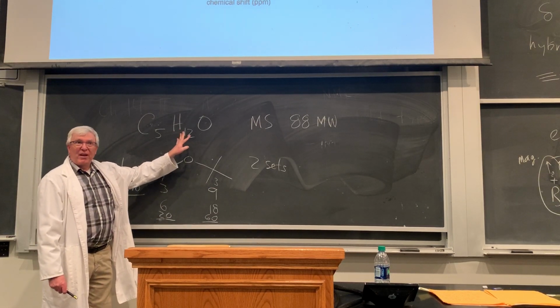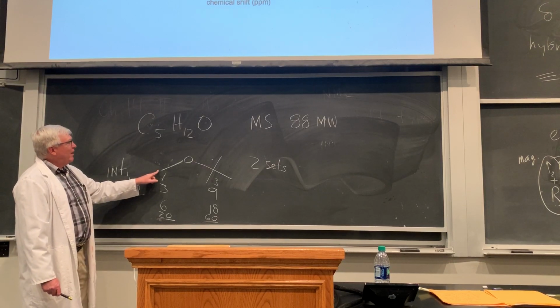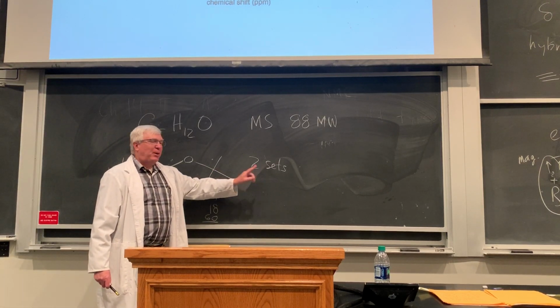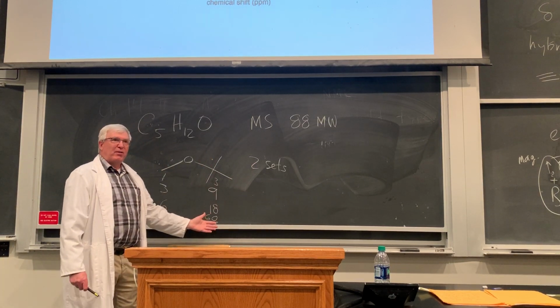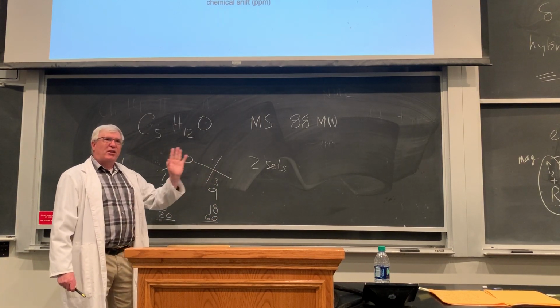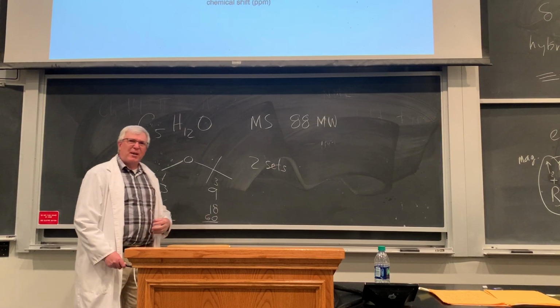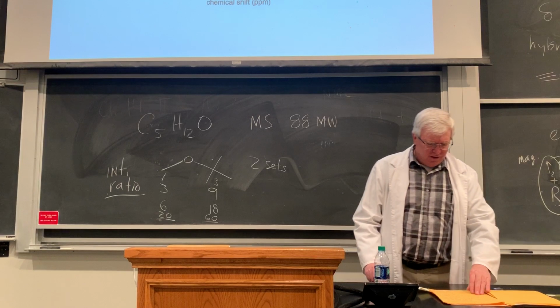So we're always thinking about what the formula might be before we apply that. A lot of times we can identify a set in an NMR spectrum where we predict there's 1 hydrogen there. Then we can divide all the other numbers by whatever that value is for that 1 hydrogen, and then we get an indication of what it might be, but we'll double check that by looking at the formula. Does that make sense? And the more you work some problems, you'll see how that could be.